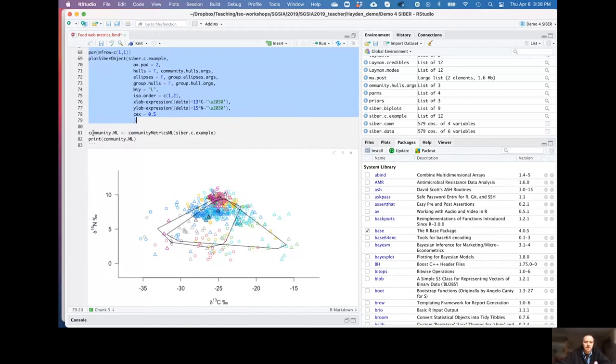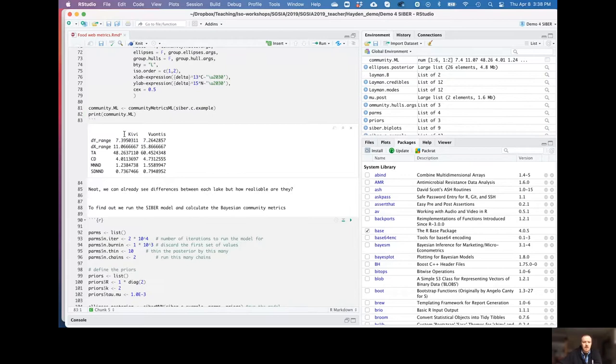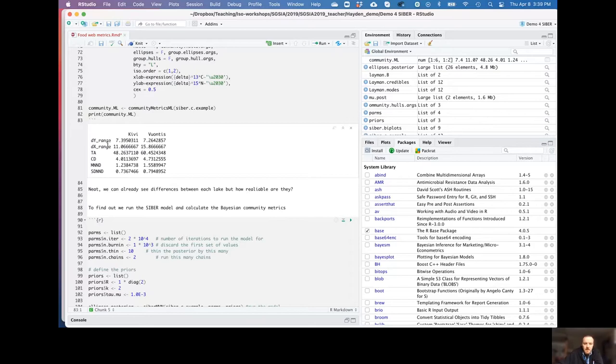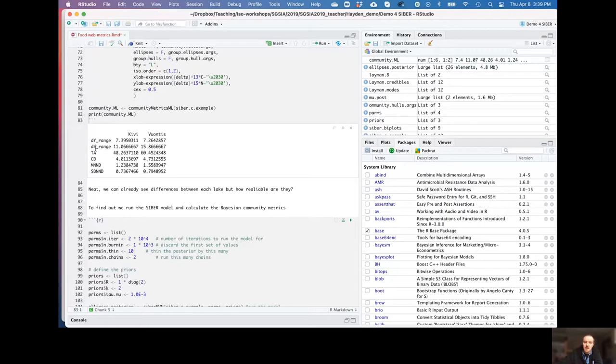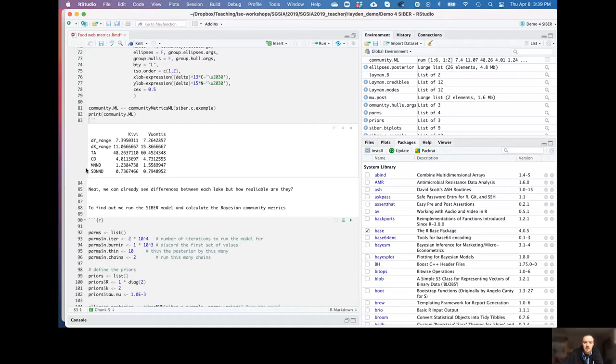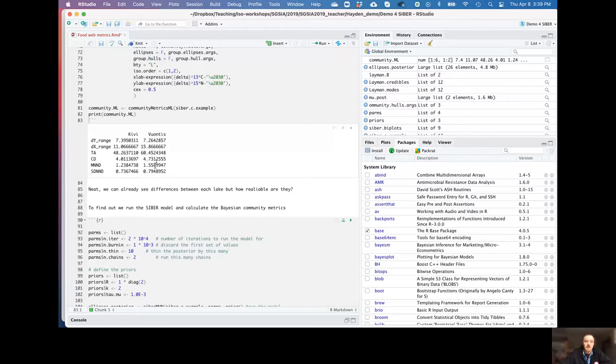And this is the hull that defines that total area. And one of the first things you might notice is that it doesn't necessarily go to the outer extremes. This hull is based off the mean value for each group. So let's take this endpoint here and you can see this endpoint is the mean of those three triangles. So we're looking at the hulls we made based off the mean of those three points of that distribution. We want to then get our community metrics just for this. And we can get that.